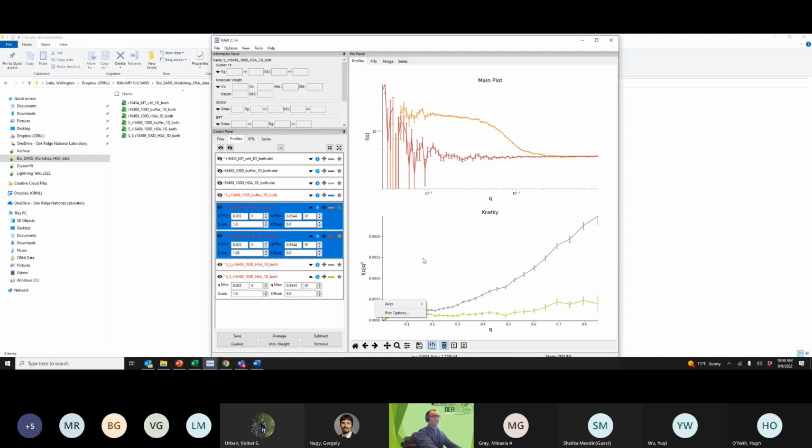Okay, let's just do some adjustments that you can also do here. We now have the I*Q^2 by Q, which is the Kratky plot analysis that I told you about, which can tell us about the conformation but also helps us do the background subtraction. It's a kind of guide that helps you define how much background you need to remove from our sample.